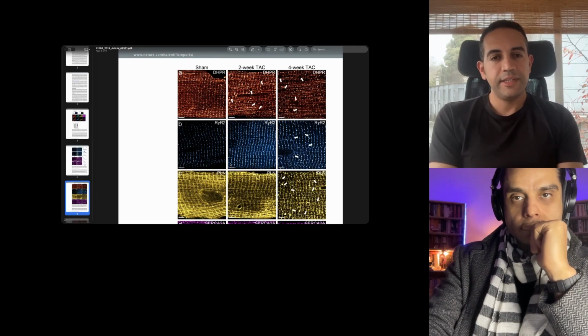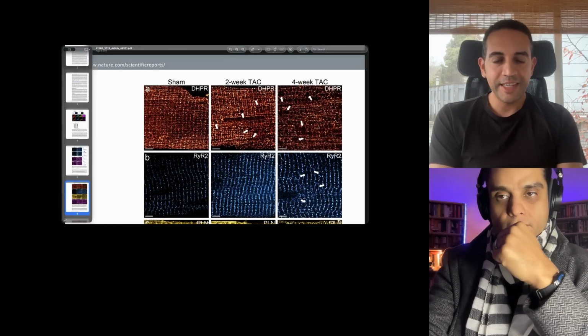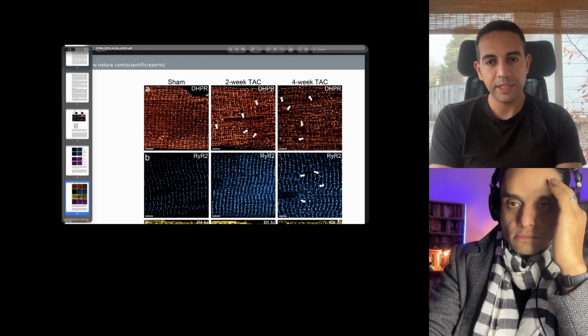And really what you're seeing, and that's even more valuable without me saying anything, is that you're going from a nicely striated motif to something that increasingly gets disordered, where you can see that the lines are getting a bit all over the place, that your proteins are moving to the spaces in between.